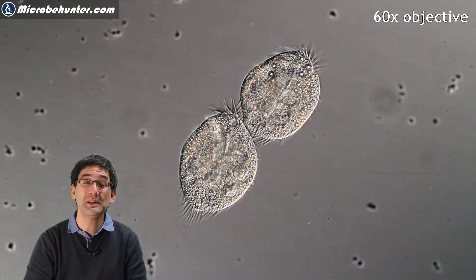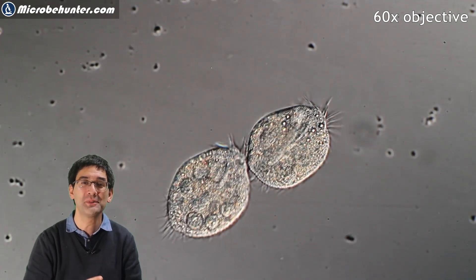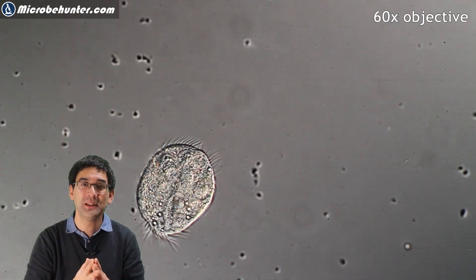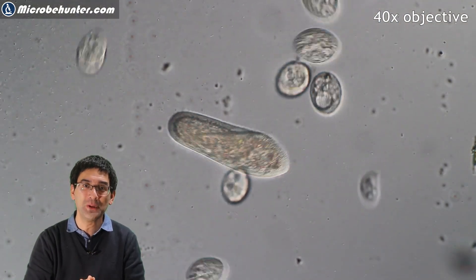Here yet another species, still connected, moving around. It might be a little bit difficult sometimes to follow them under the microscope because they immediately move away — and now it divided as well. So this is basically all I wanted to show you today.